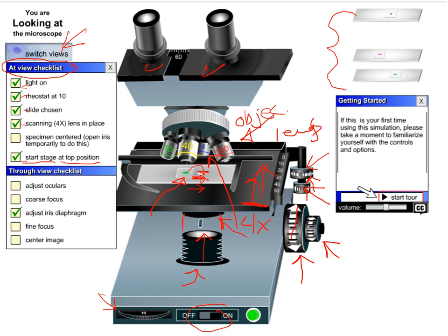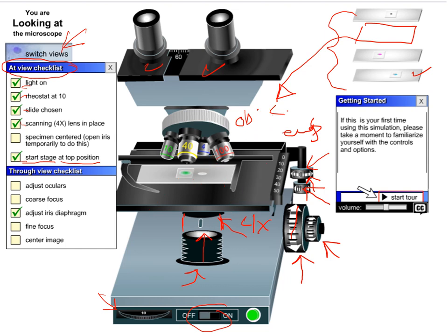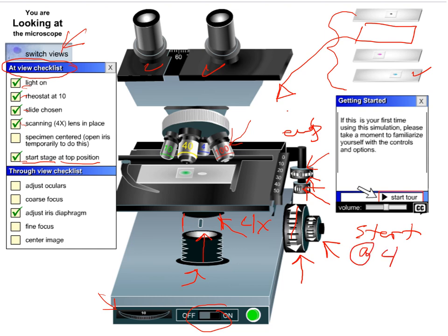These are the four slides you can choose from. I clicked on one and it went over to the stage. I believe this one is the cheek cell — you can click on them and it'll highlight and show you a word describing what it is. Students often say they can't see anything in their microscope, and that's because they've accidentally tried to start on the 100x — it's simply too zoomed in. It's kind of like using super high-powered binoculars without focusing them. You always start at low power — start at 4x.